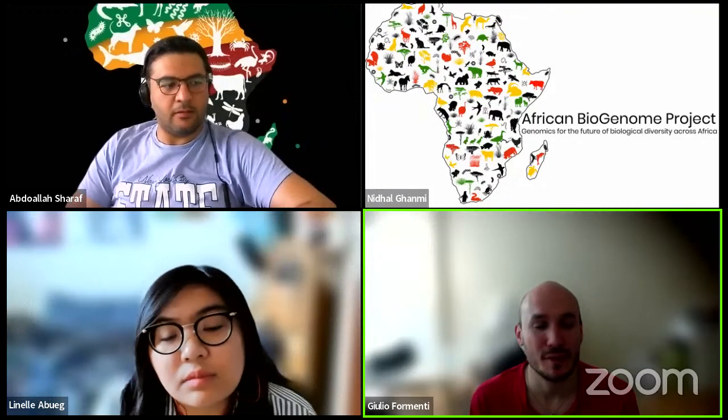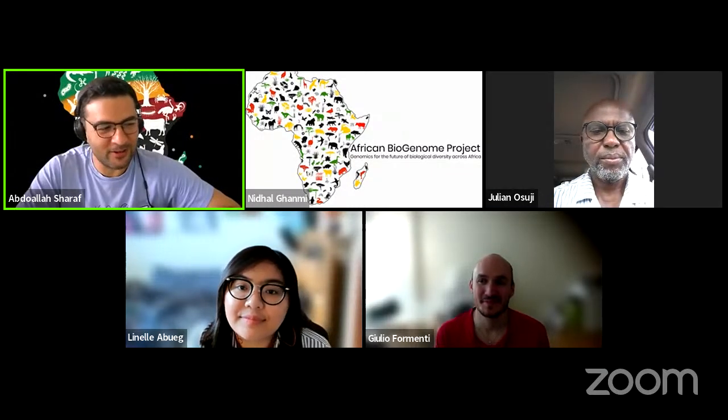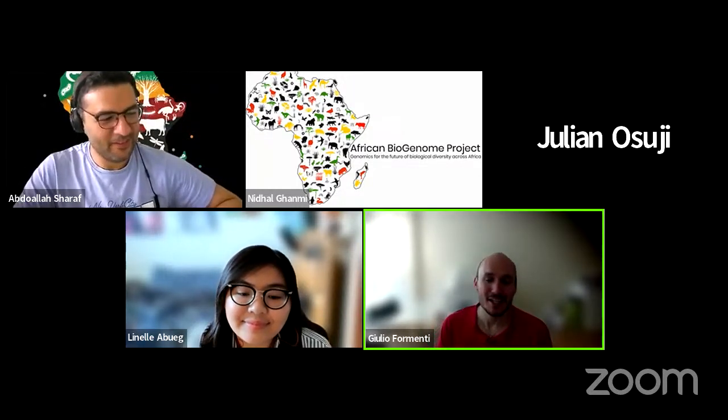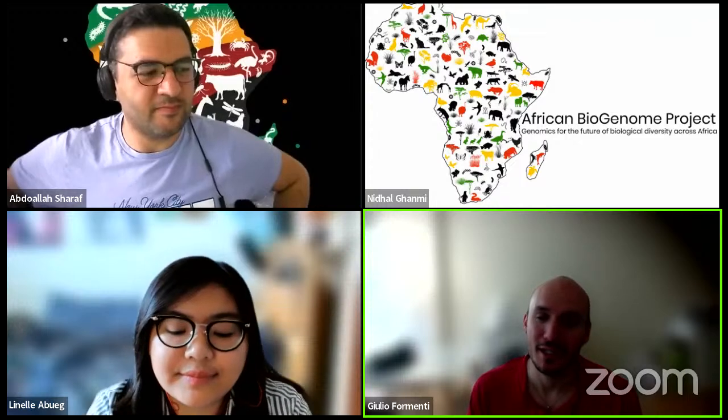The Darwin Tree of Life at Sanger does a lot of plants. In fact, my colleague Olivier Federico, the director of the facility, always jokes and says we're never going to do plants, because extracting DNA is painful. We always have this problem, not really with the sequencing, but even before the sequencing, getting the DNA itself. For many plants, it's not necessarily more complicated than vertebrates. Some are diploids. Even if they are more than diploids, the algorithms are pretty good now and they work with plants as well. But yes, getting good quality DNA can be really complicated.